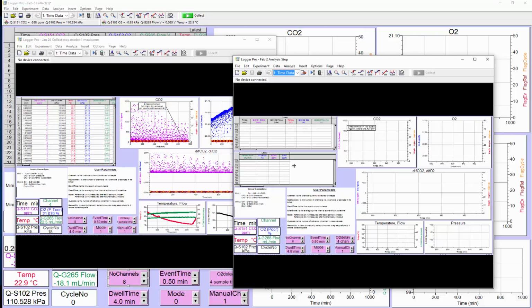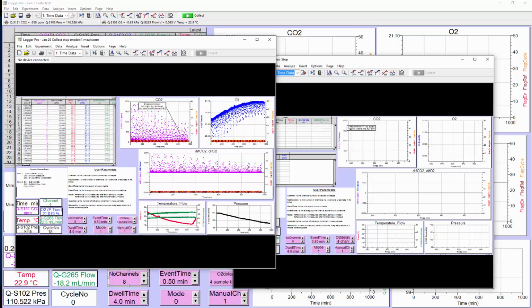And then this input data from the collection program is used in all the calculations and fills all the graphs and does the sorting into the various chambers. So let's bring over that data. So shift and click on the channels. You'll see them go gray when they're selected.